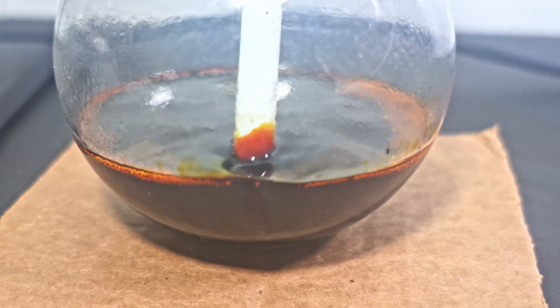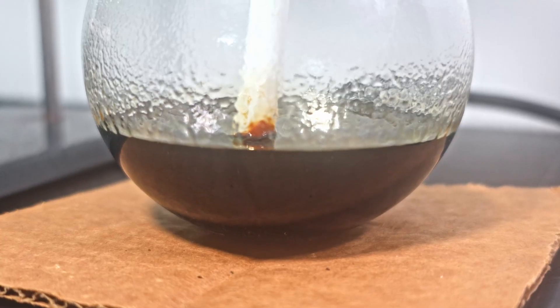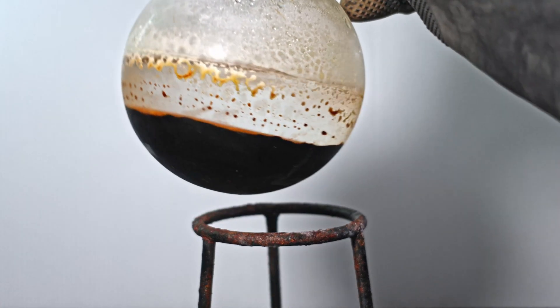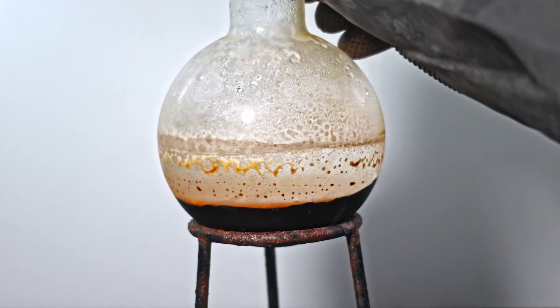Chlorine evolution is still going though. Within the hour, bubbling has either slowed or the oil is too thick to allow reasonable pumping. I know I have chlorinated hemp oil because beyond the color change, it is also denser than water. It is even very viscous.